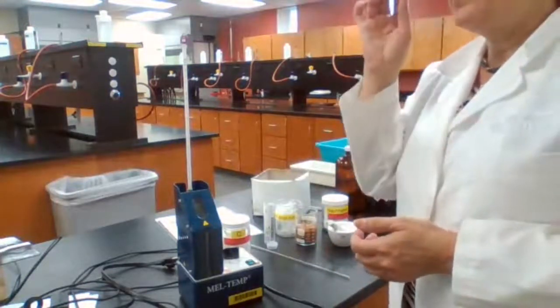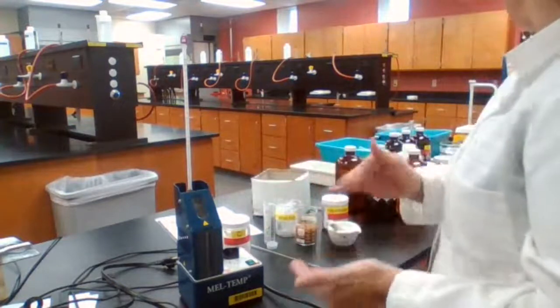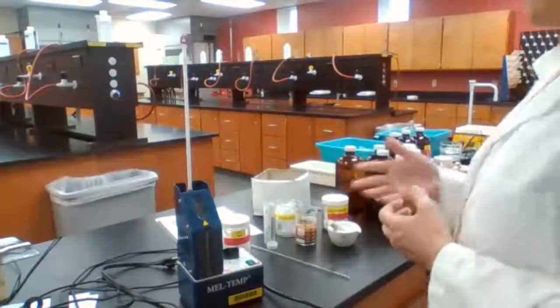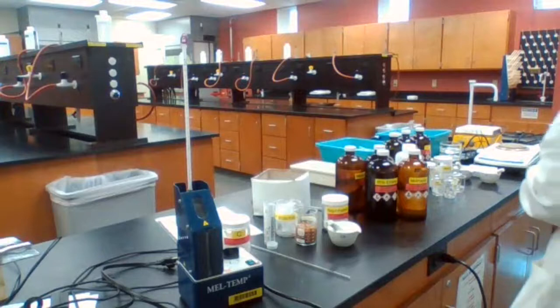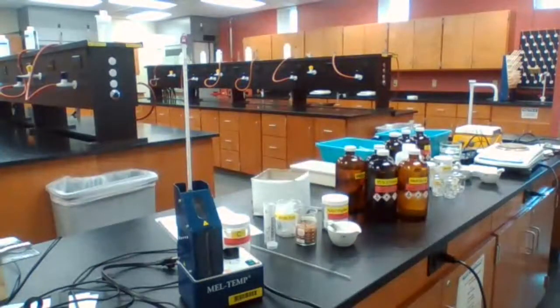Okay, while I'm waiting for the melter to cool down, I'm going to prepare a hot water bath, because we are using boiling point for the sample in our experiment. For boiling point, I need hot water.